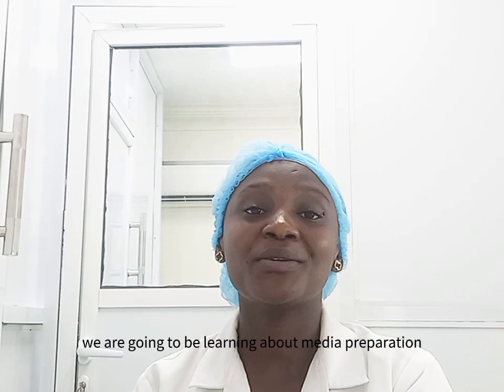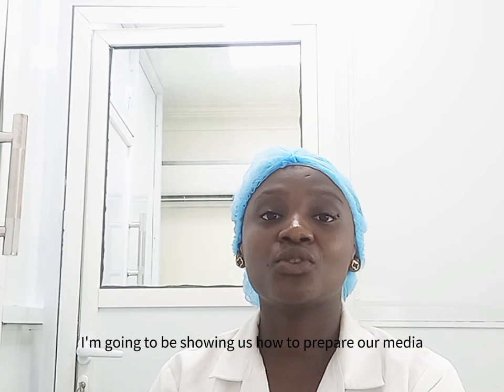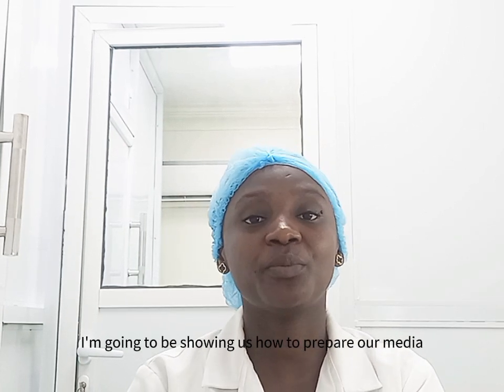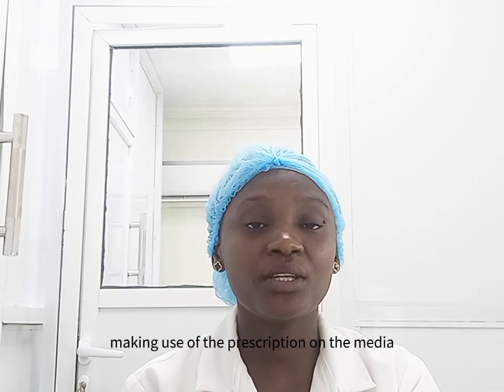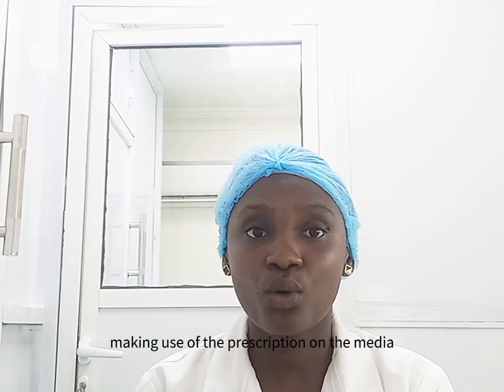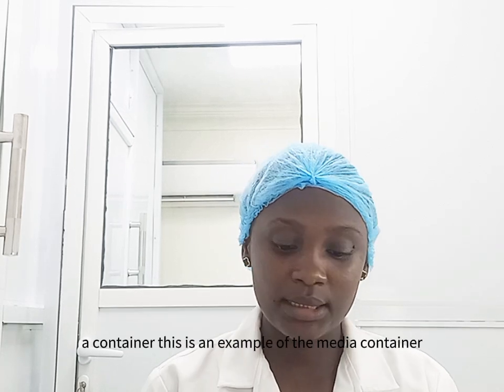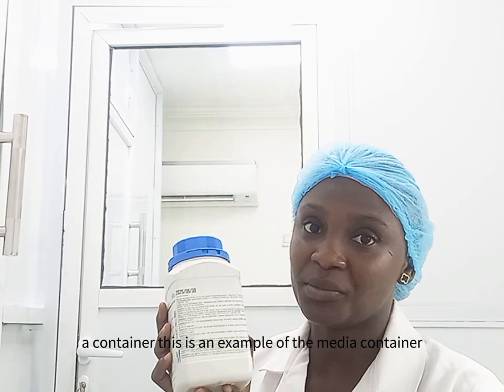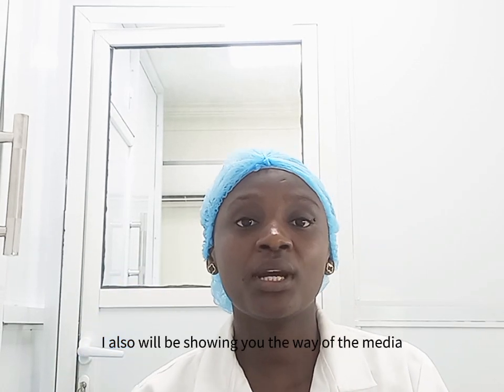So today we are going to be learning about media preparation. I'm going to be showing us how to prepare our media from the calculation of the media, making use of the prescription on the media container. This is an example of the media container.